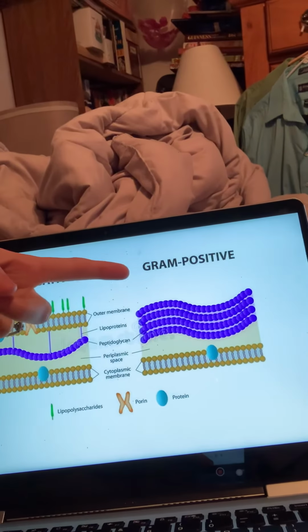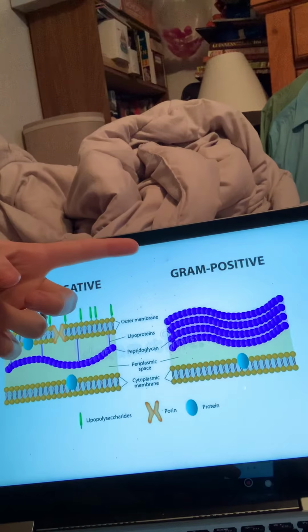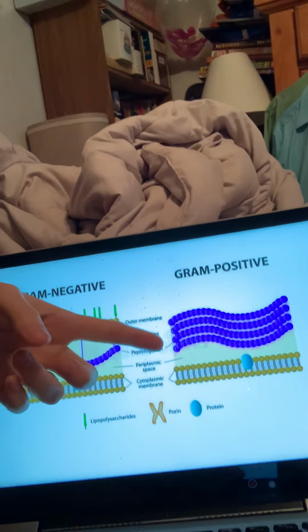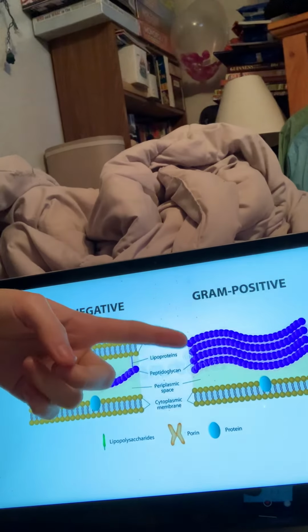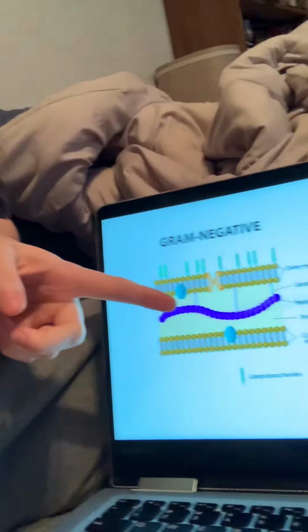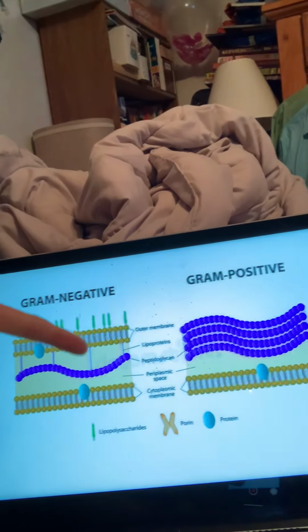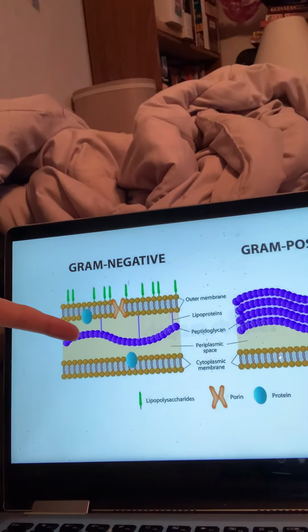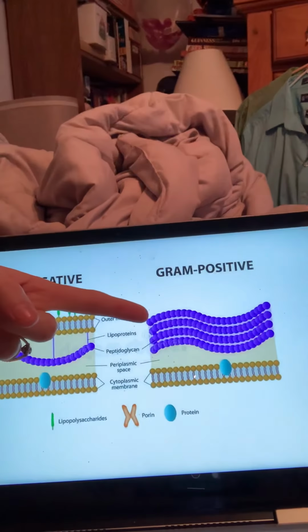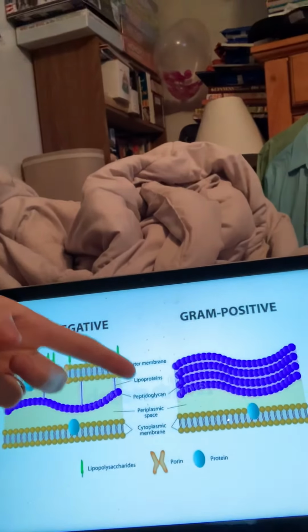And on the other hand, our gram-positive that we have here has such a thick peptidoglycan that all that purple is going to just absorb right into it and love it. It's going to be super difficult to wash out 1, 2, 3, 4 layers versus 1 layer on our gram-negative. So that's why the difference is, because gram-negative, again, has a very thin peptidoglycan layer, and gram-positive has a very, very thick peptidoglycan layer.